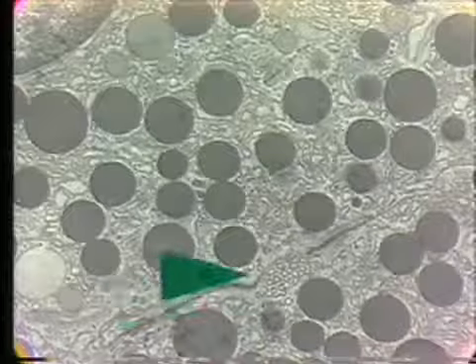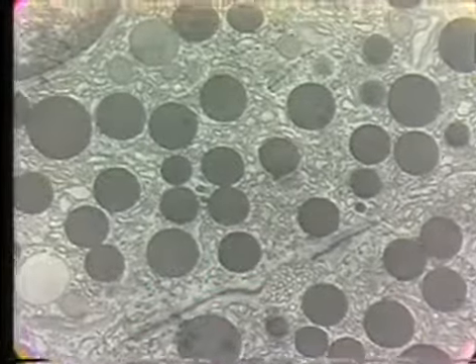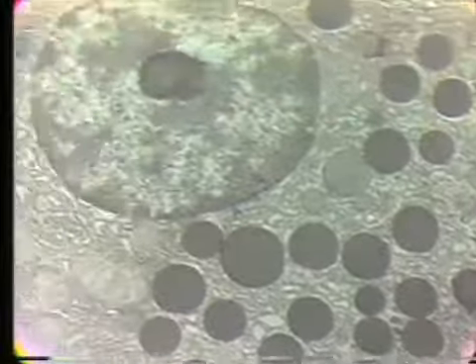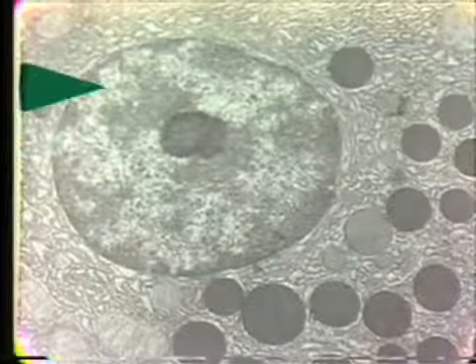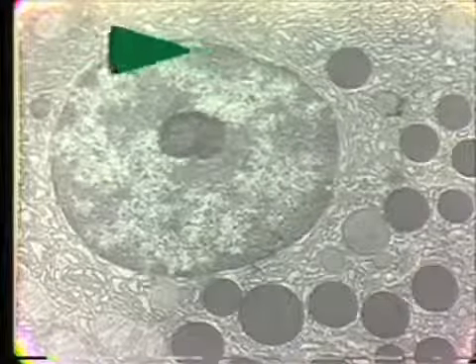Now if we look at the nucleus of this cell, we'll see the components of it. The nuclear membrane surrounds the nucleus, and we'll point to that. It's a two-layered membrane.